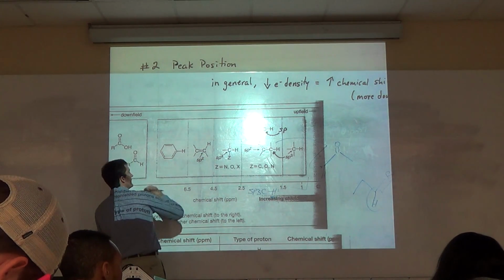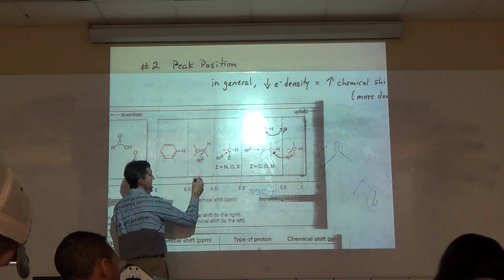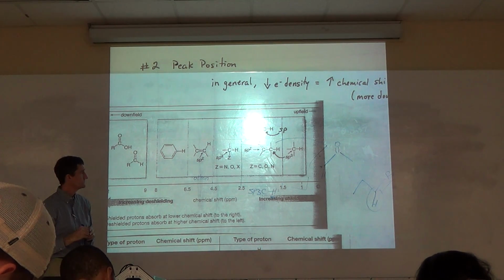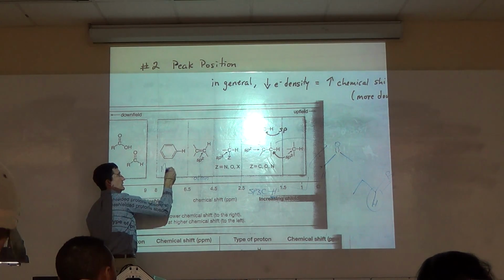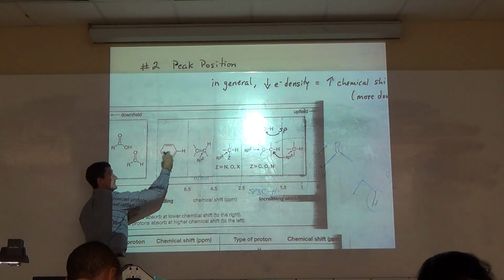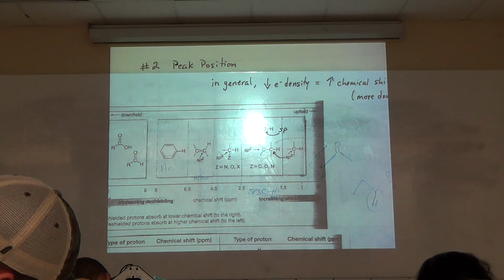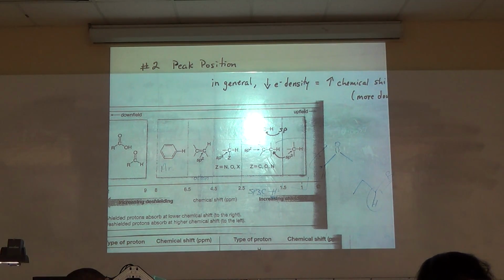Okay, come on downfield, you get sp2 CHs. Two different sections though. These are typically your alkene. That's going to be about 5 to 6 ppm. Now your aromatic, that aromatic ring, like a benzene ring, that's even more downfield. That's like 7 to 8. Now we'll routinely say aromatic region is 7 to 8 ppm. Of course, it might be 6 to 9. But 7 to 8, okay?